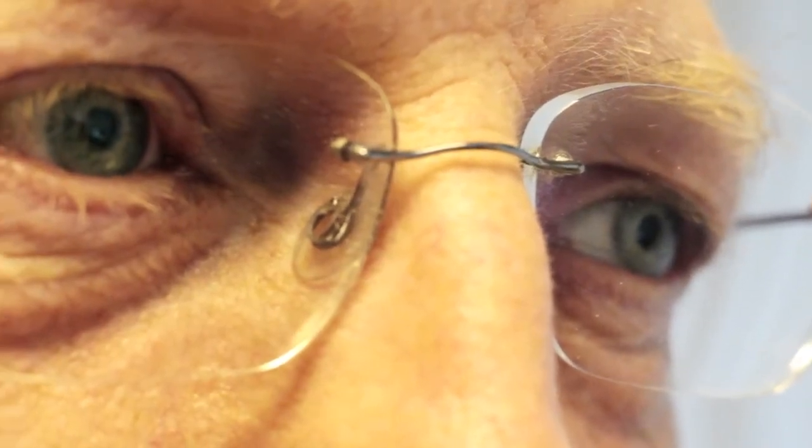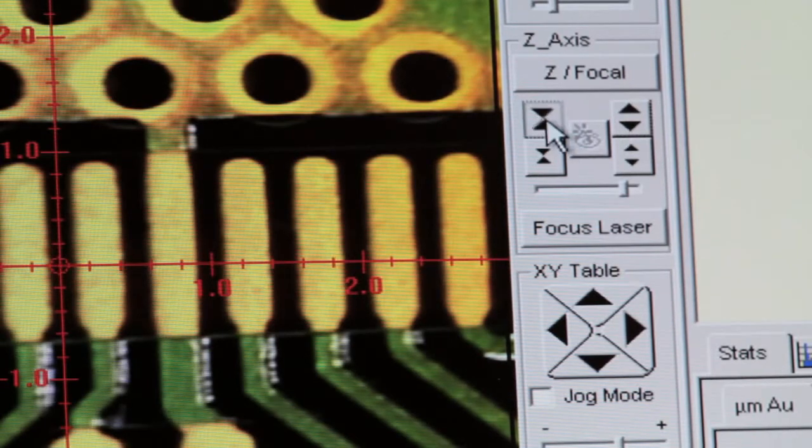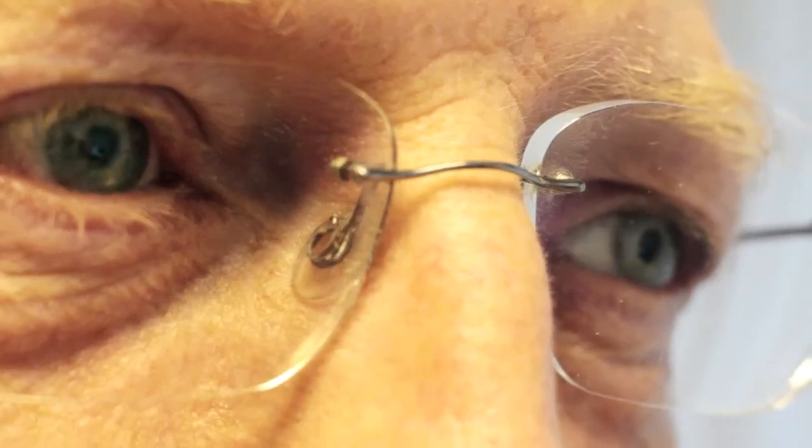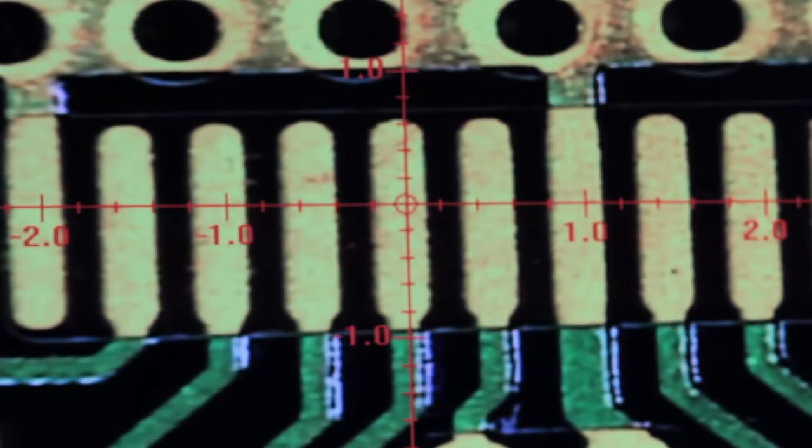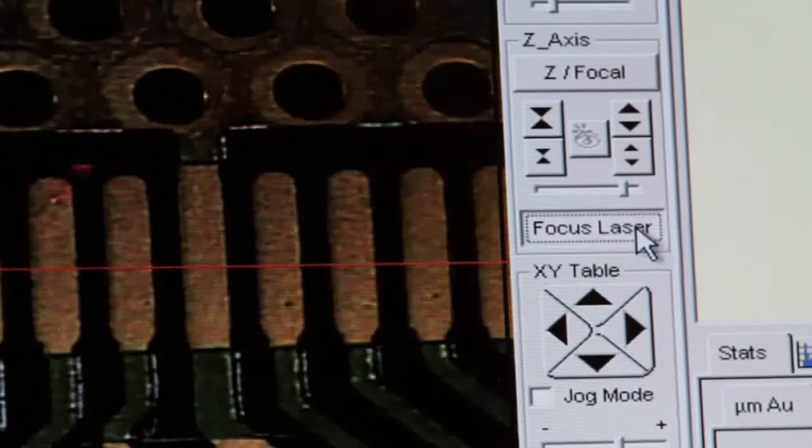Next, bring the image into focus using the point-and-click focus laser. This ensures results repeatability and accuracy, irrespective of the user.